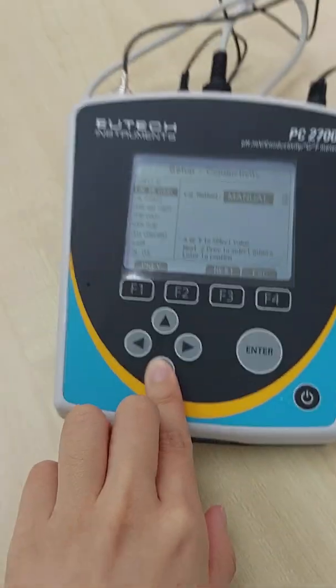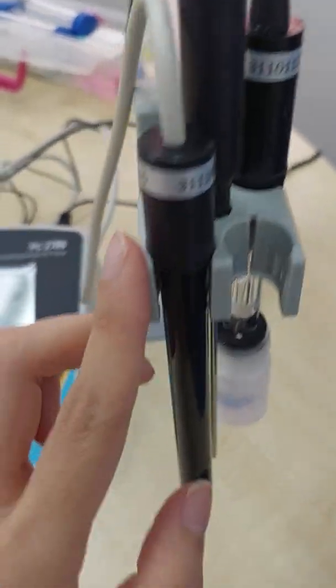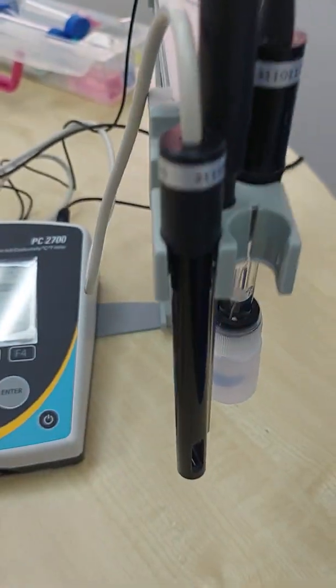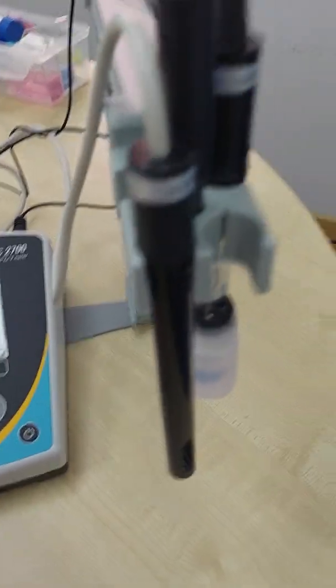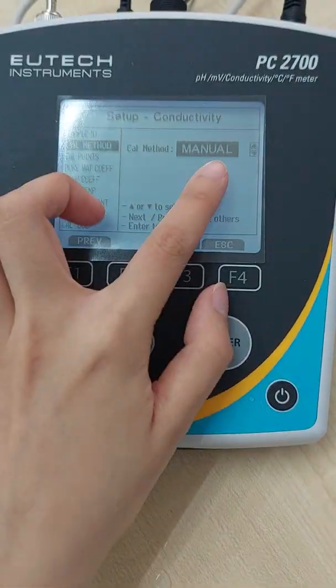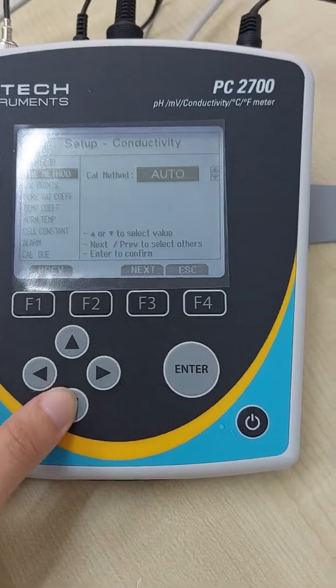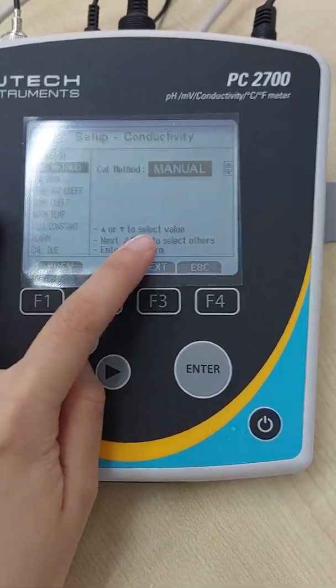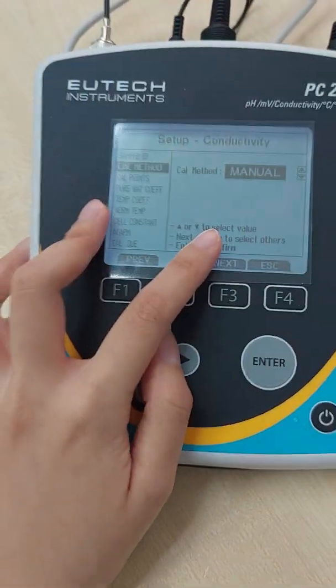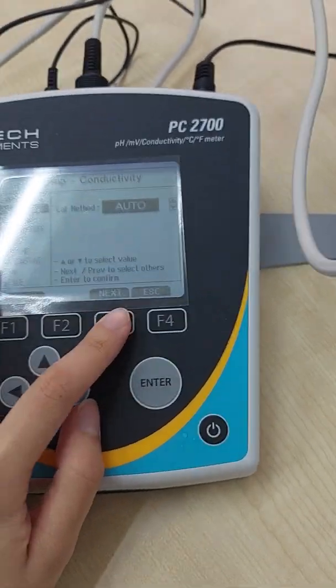If you set manual, once you immerse the probe into one four one three, you will need to manually adjust to one four one three. That only considers calibration done, manual calibration. So manual calibration, you will need to use it on TDS and salinity. Only conductivity has the automatic function.